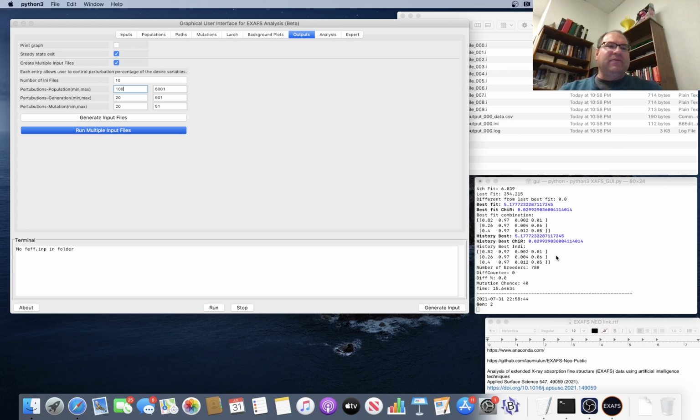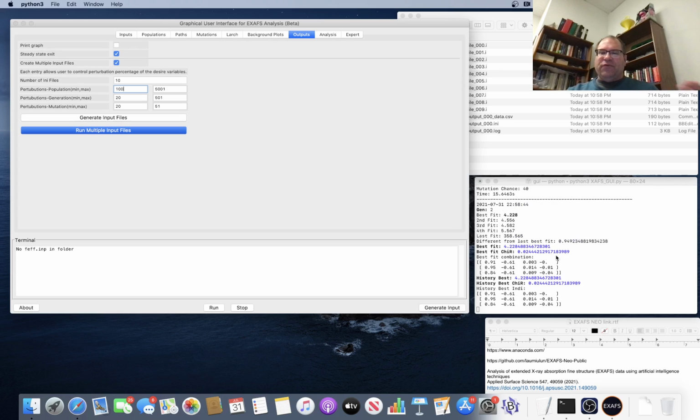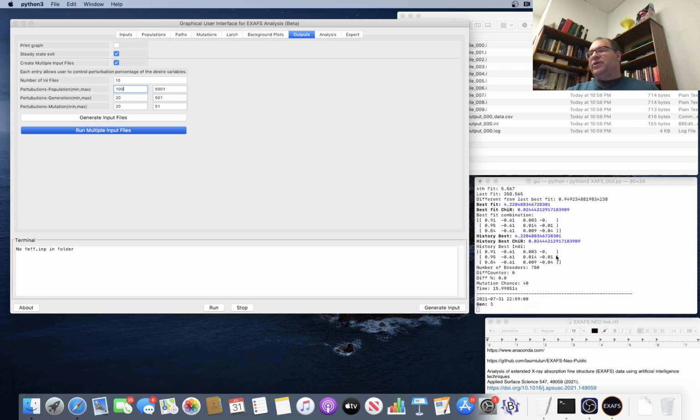With the amount of population, generations, and mutations that we have here, it's taking almost 16 seconds for each generation to go through. So this is going to take a long time. So right now I'm going to pause the video and then I'll come back at the end.